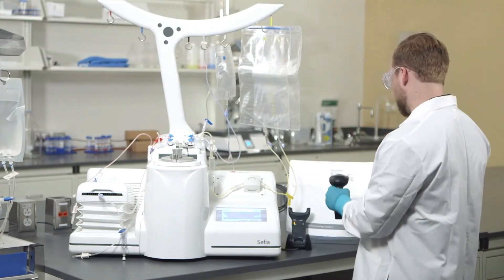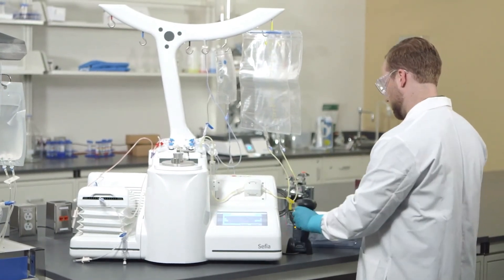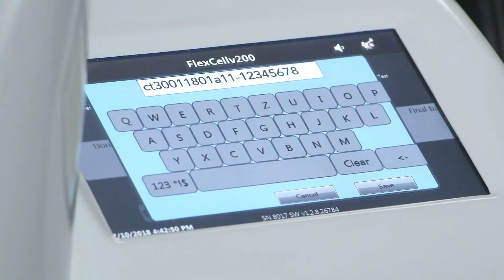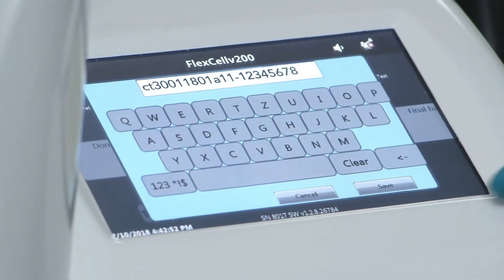Insert traceability information. Review summary data, including parameters selected and traceability data.